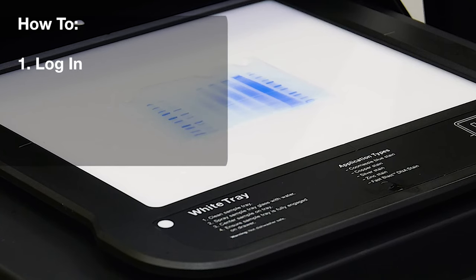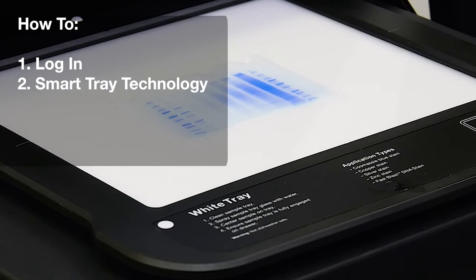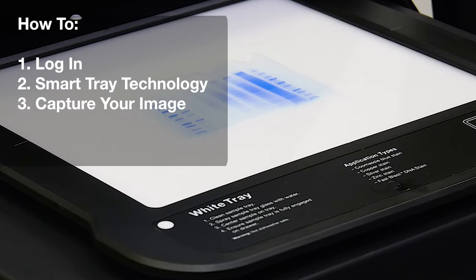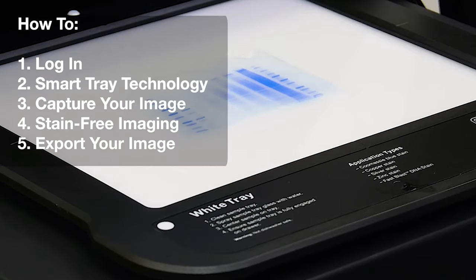In this video, you'll learn how to log into your KemiDoc, use SmartTray technology, capture protein gel images in three easy steps, how to use stain-free imaging, and export your images.